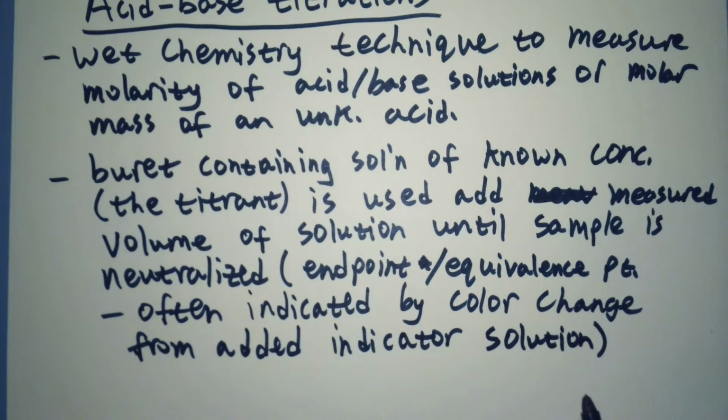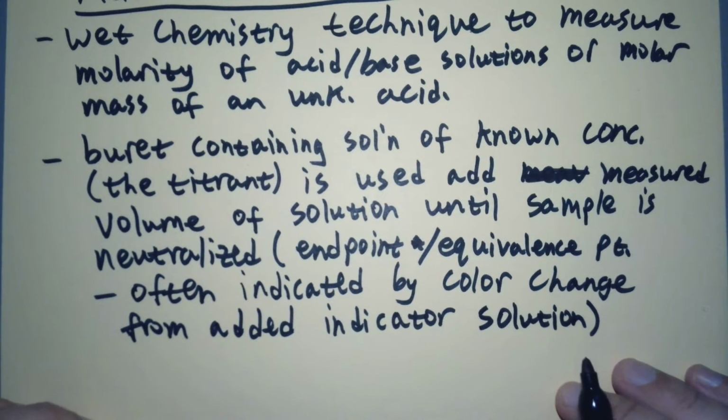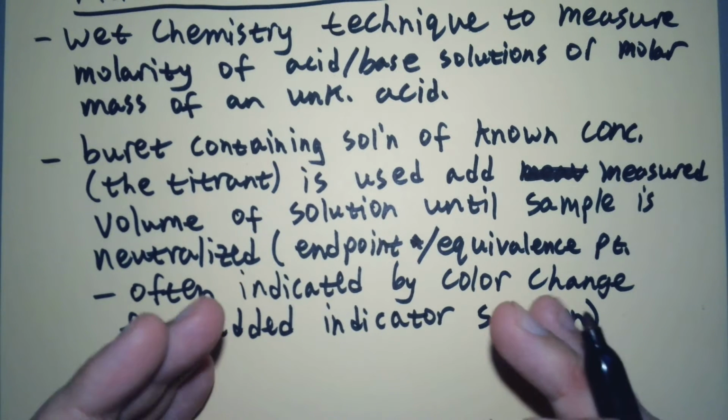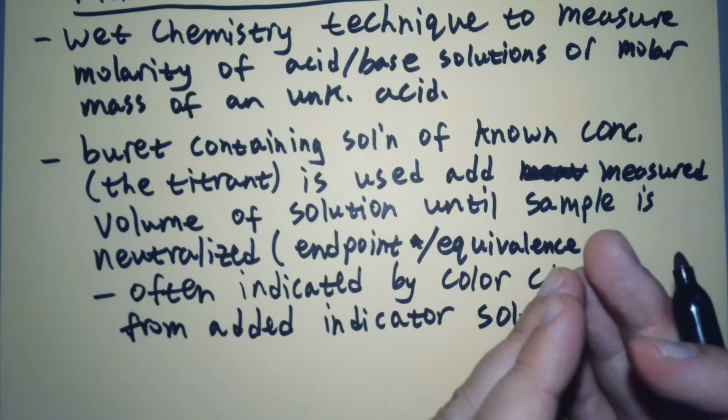And you'll get to play around with this stuff in the simulation, which is too bad because it's one of my favorite labs to do. And like I said, that phenolphthalein indicator goes from colorless to faint pink. If you overshoot, I call it a violent shade of pink.